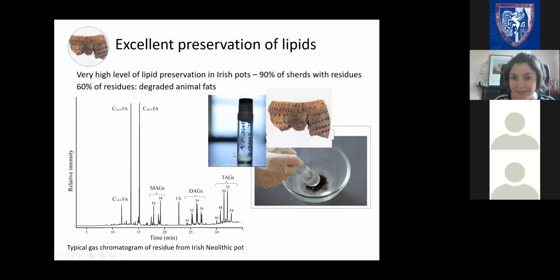That's just a little vial, a 7 ml vial, about 3 or 4 centimeters high. These traces are so tiny that you can't normally see them with the naked eye. They're invisible, which makes for a very weird sensation when you're working in the lab on things you can't see.